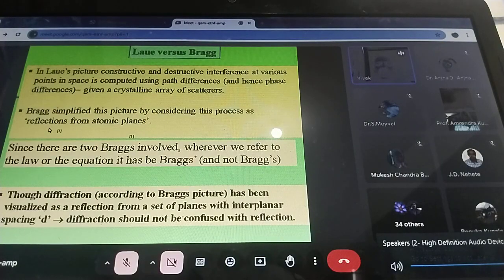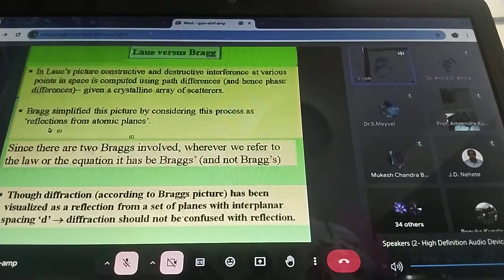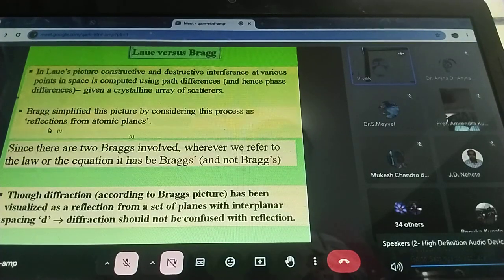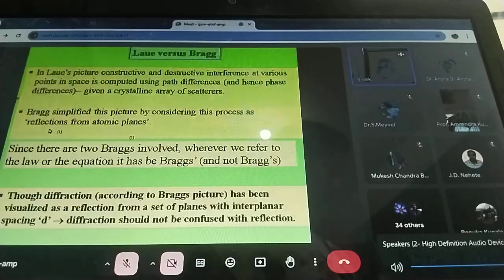What is the benefit of discussing all this is, for any crystallographer, knowledge of extinction should be very, very important. Only on the basis of extinction, what reflections are absent, it is decided what is the space group out of the 230. Because the space group of your crystal is 1 out of the 230.